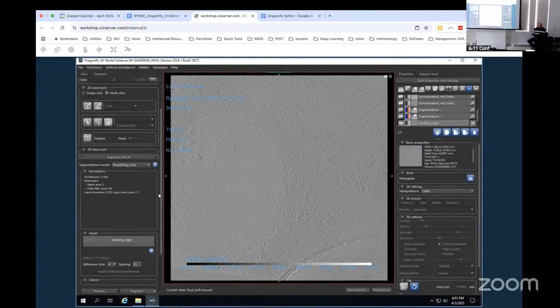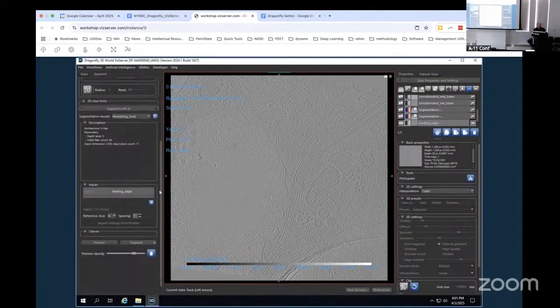Where did you get the neural seg local from? I opened up the deep learning data, but not the deep learning tools, under artificial intelligence. Import, oh, okay. Then go to models. Thank you. Sorry about that. That's okay. I was opening the neural seg data. I see. Okay.